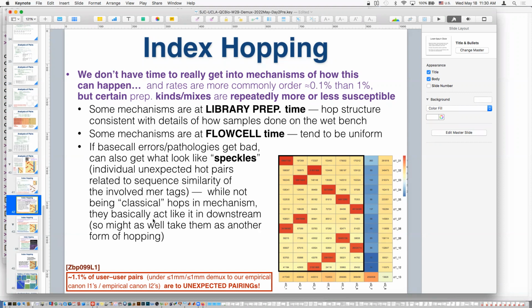People think of the classical index hop. And that is if base call errors get so high that an appreciable fraction of the wells that really belong to that guy get so far away that they start landing in other guys' piles. So maybe I have two targets, which relative to the entire set of targets I'm laying out, the target distances are all at least 3 mismatches.